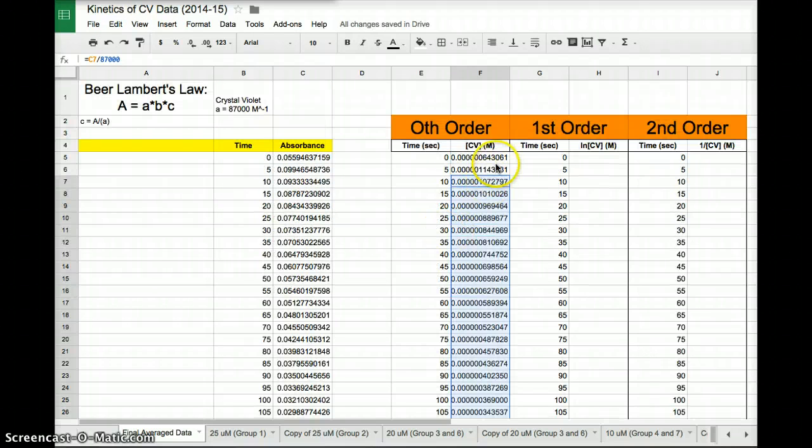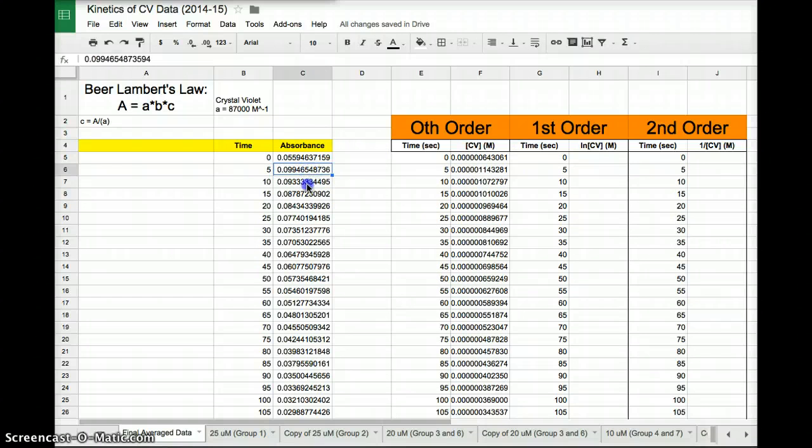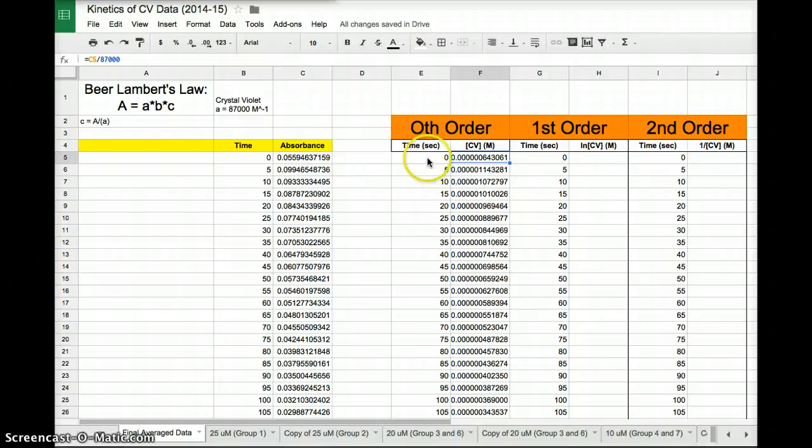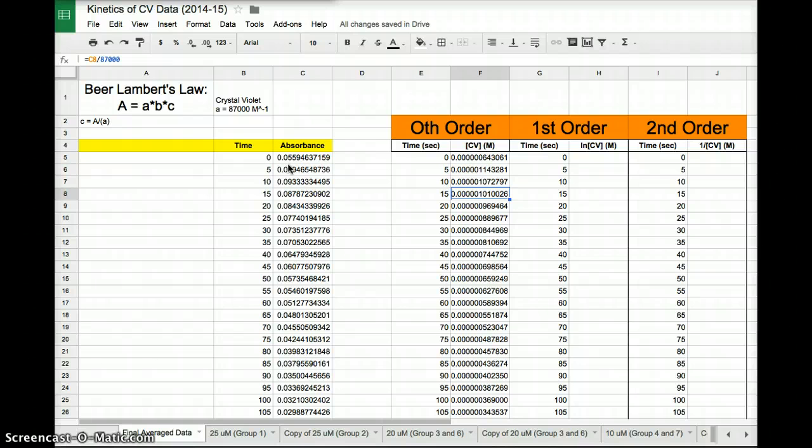So what did the computer do? It took each one of these values, depending on the row that it's in, and divided it by 87,000. So if we look over here, it took the number in block C5 divided by 87,000. Here it did the block in C6, C7, C8. It did the whole thing for us. That's pretty cool.